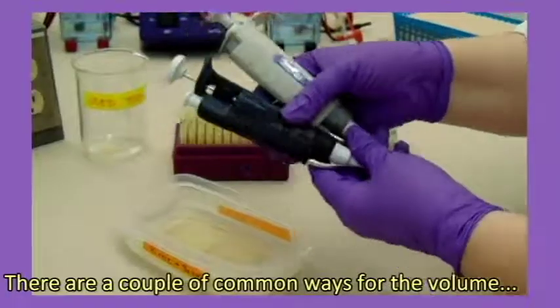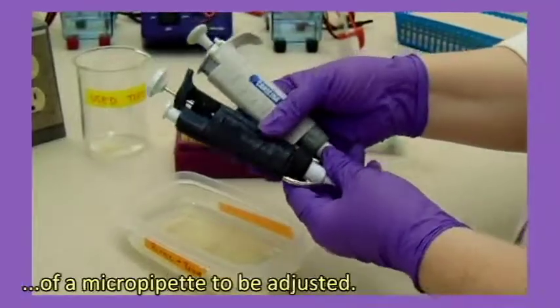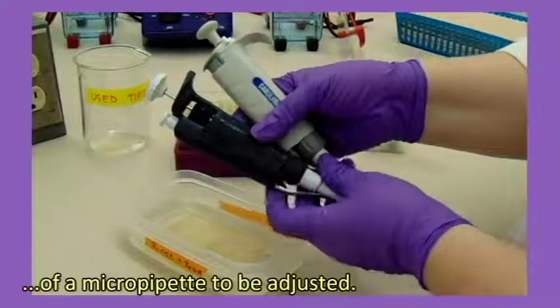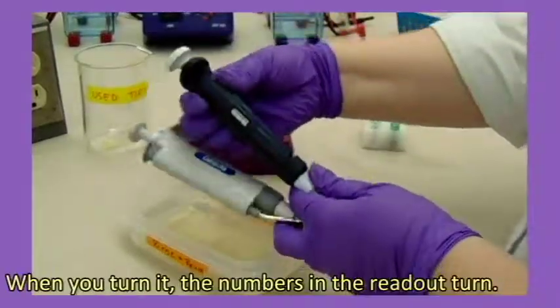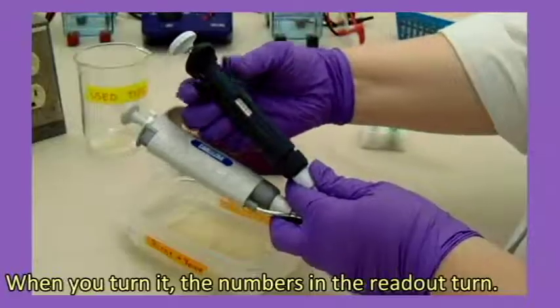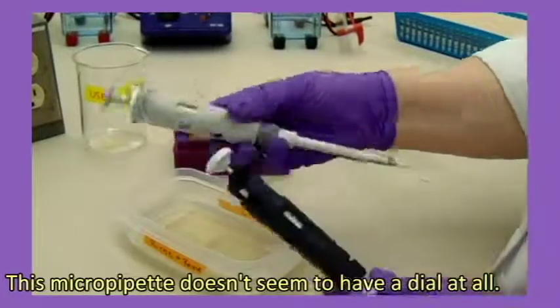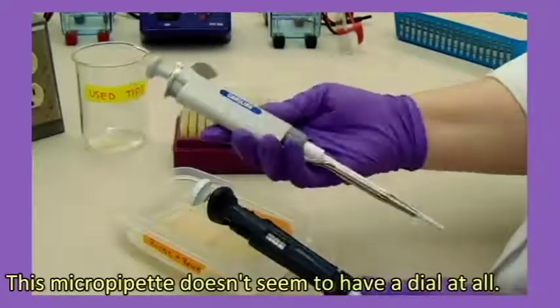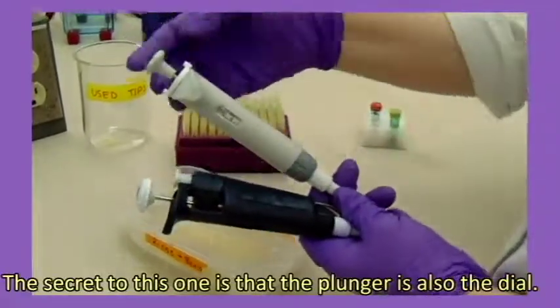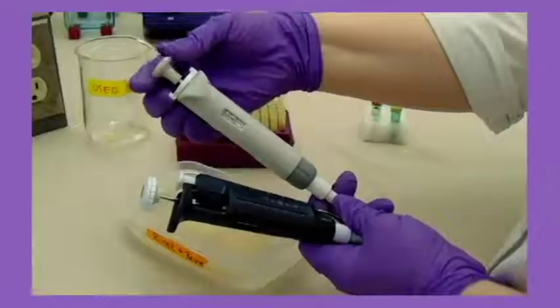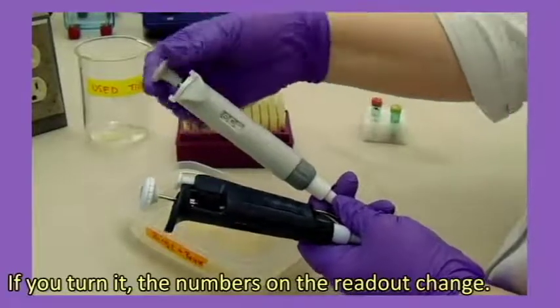There are a couple of common ways for the volume of a micropipette to be adjusted. This one has a separate inset dial. When you turn it, the numbers on the readout turn. This micropipette doesn't seem to have a dial at all. How do you adjust the volume? The secret to this one is that the plunger is also the dial. If you turn it, the numbers on the readout change.